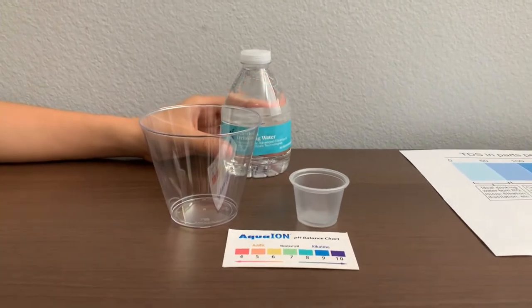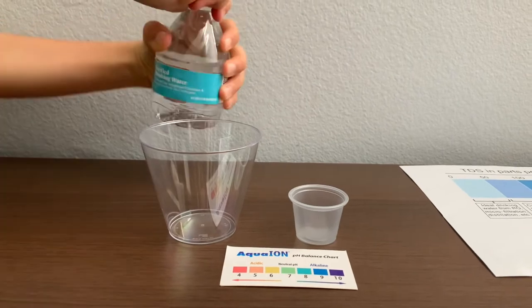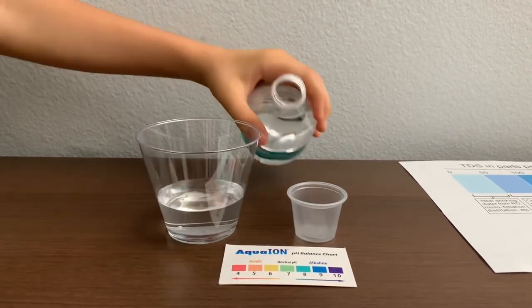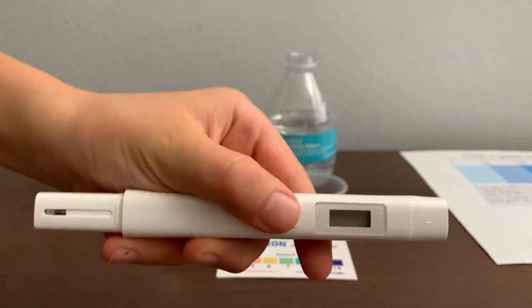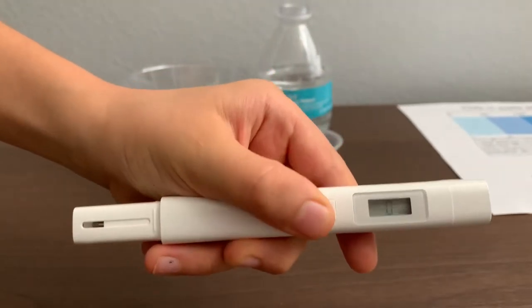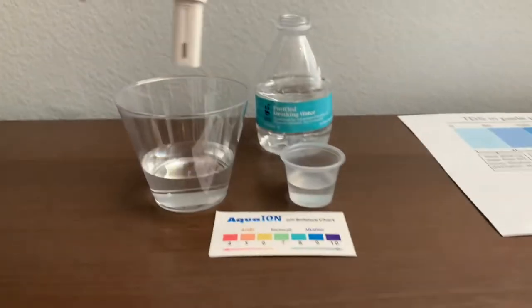Let's test the pH and TDS levels. Let's pour some water in. First, we're going to test the TDS level. If you want to buy this TDS tester, check the link down below. Turn on the TDS tester, make sure it says zero, and put it in.